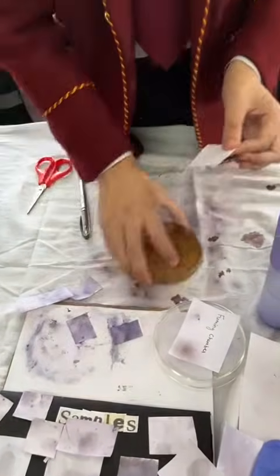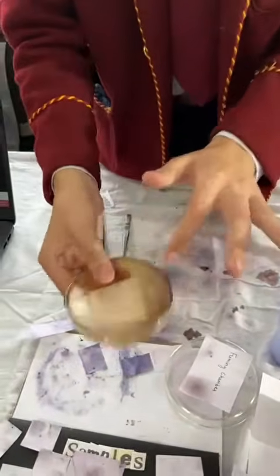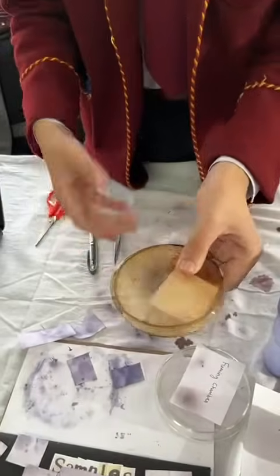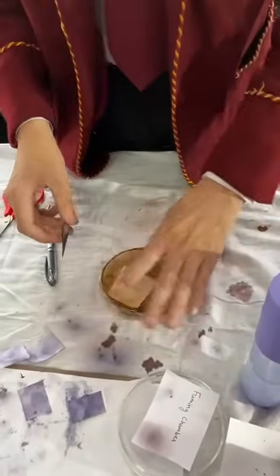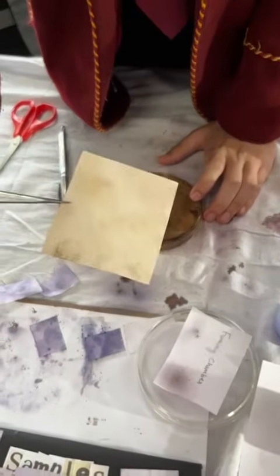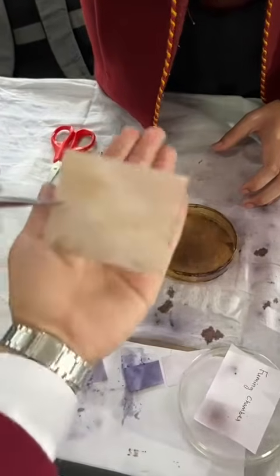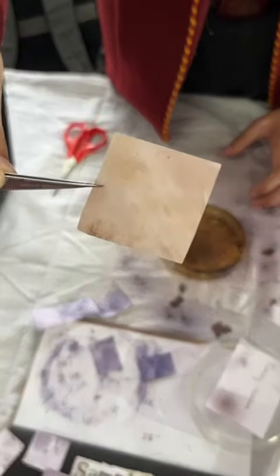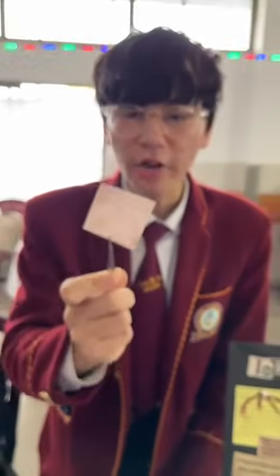So I'll show you a demo. I'll keep this in right now. The brown fumes are attacking the oil present in this paper and thus revealing to us the fingerprints. And this takes about 30 seconds to 1 minute. See, it's already done. Can you see? So this is how fingerprints are being developed.